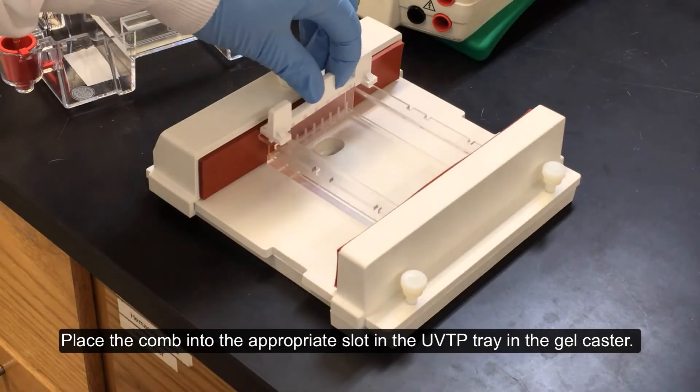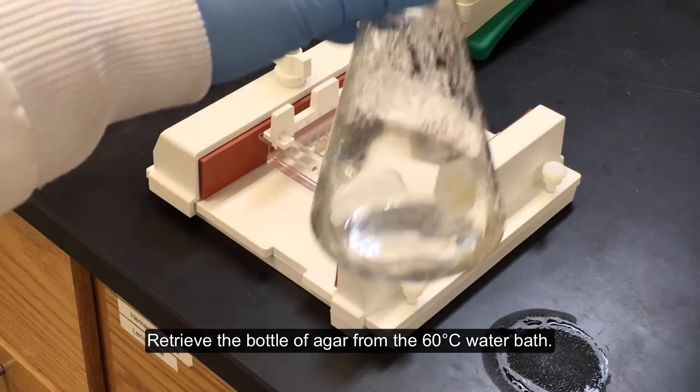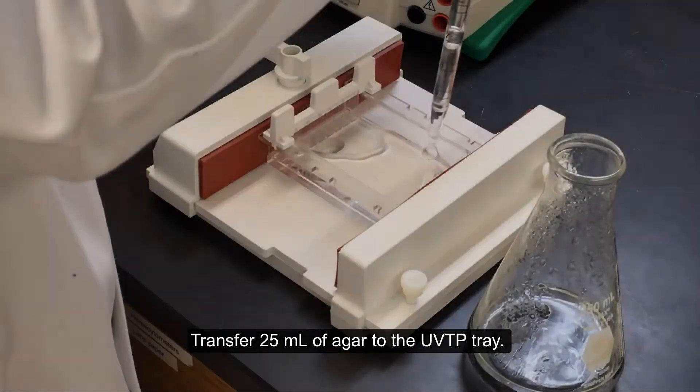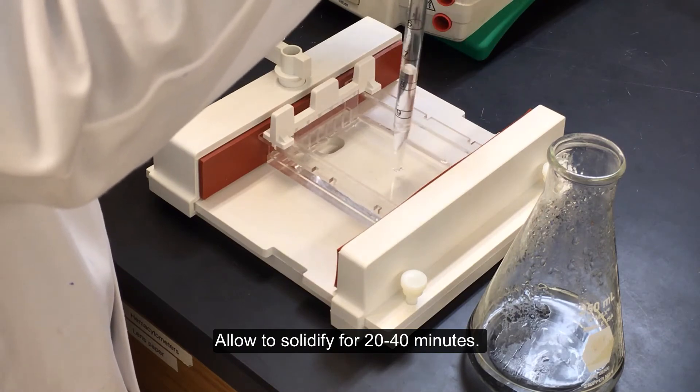Place the comb into the appropriate slot in the UVTP tray in the gel caster. Retrieve the bottle of agar from the 60 degrees Celsius water bath. Transfer 25 milliliters of agar to the UVTP tray. Allow to solidify for 20 to 40 minutes.